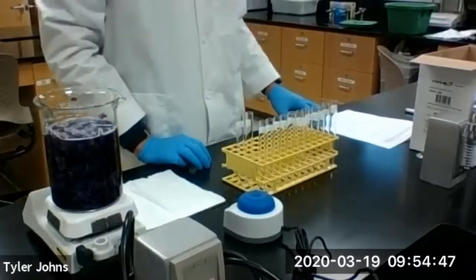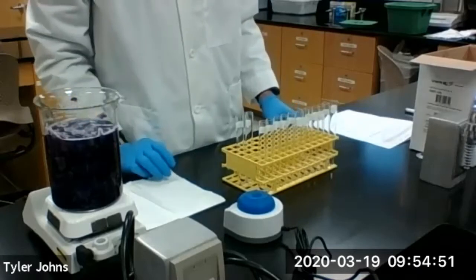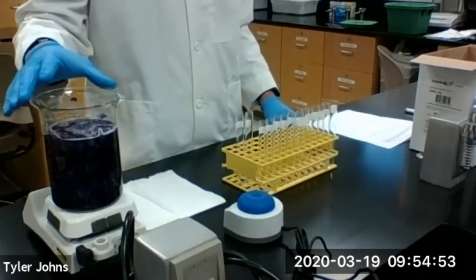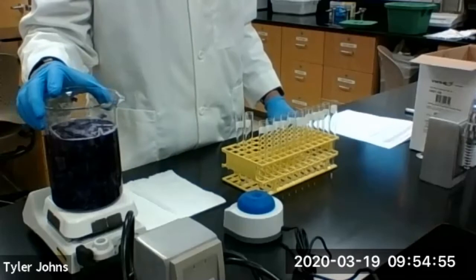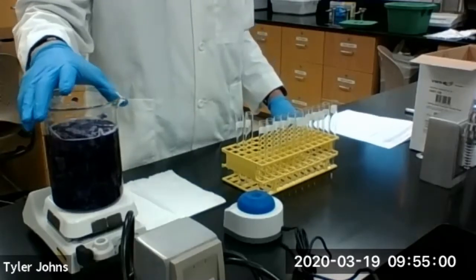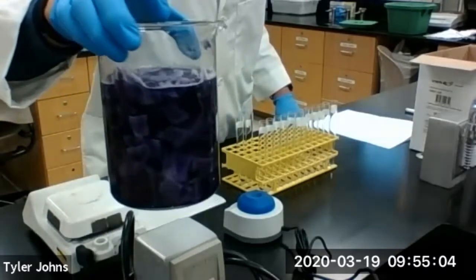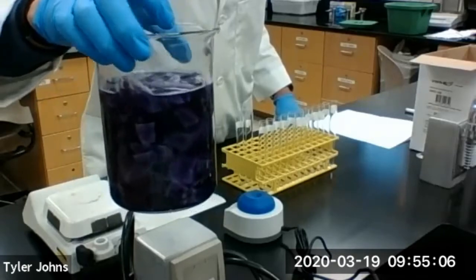Okay, so in part A of this experiment, we're going to be preparing a natural indicator out of cabbage juice. I've already gone ahead, cut up the cabbage and boiled it and brought it back down to room temperature. In doing this, I've extracted the pigment out of the cabbage leaves, and you can see how dark purple that water has become.